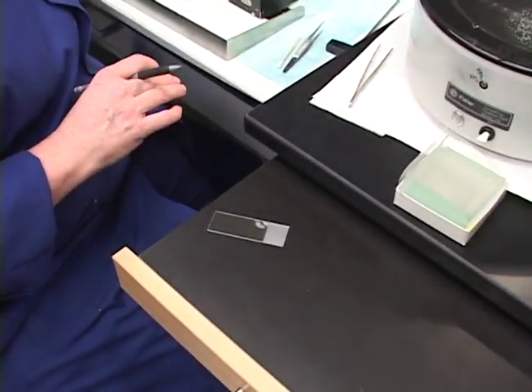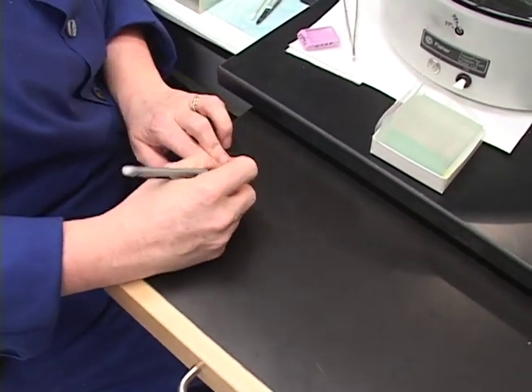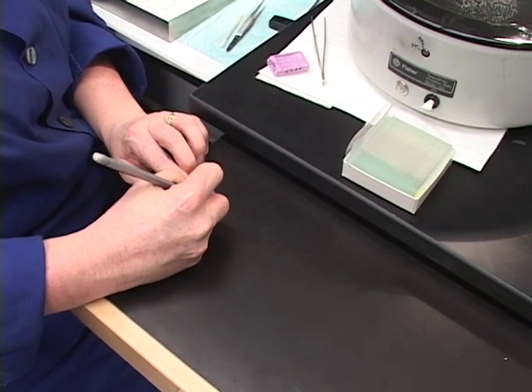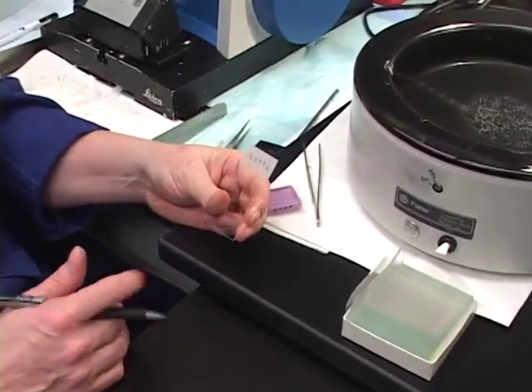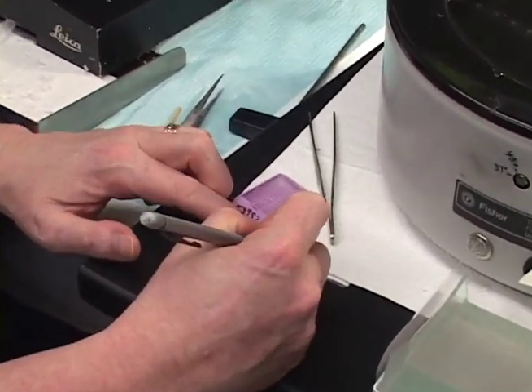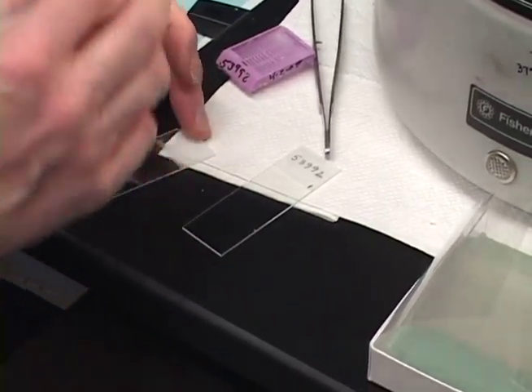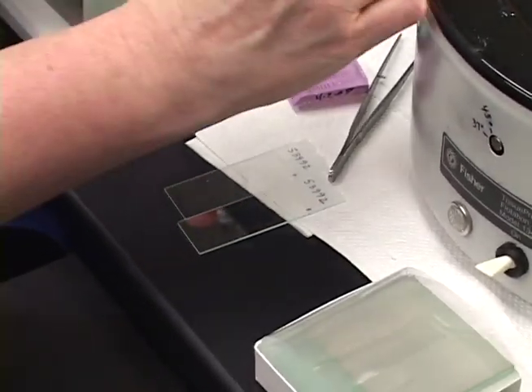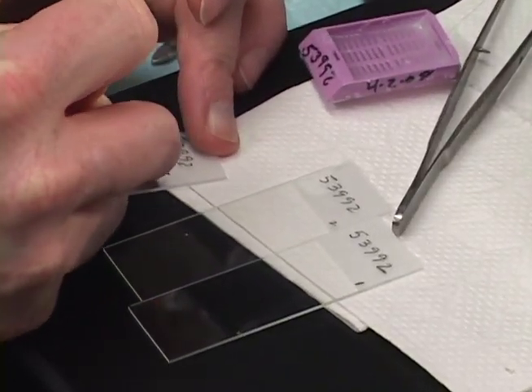As you're cutting your block, you label your slide and have it ready. If I'm doing serial consecutive sections, I label the slide with the case number — for example, 53992 — and put a number in the bottom: 53992-1, 53992-2, 53992-3, and so on, picking them up in order for consecutive sections if I'm doing serial sectioning.